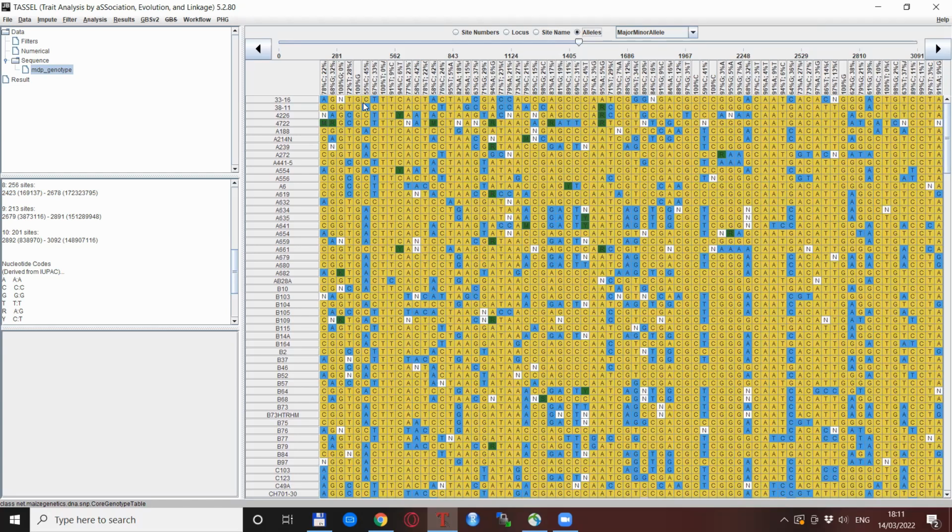But anyway, you see that there is a C and an A here, with 55% C, and the A is the minor allele with 0.45, or 45%. You can see similarly for all the other alleles. This setting will be quite useful, because in a bit we will do a quality control, or filtering, according to the minor allele frequency, and we will see that some of these columns will disappear according to our setting.